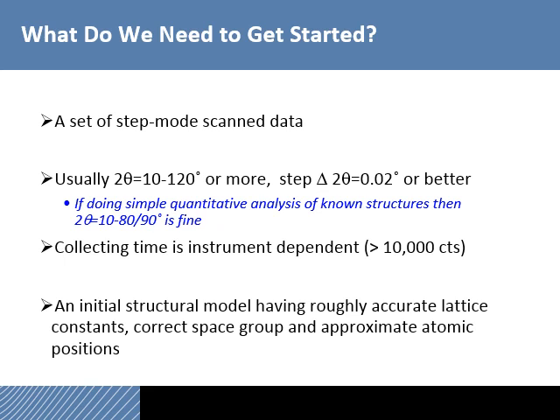And then you need some kind of an initial structural model having roughly accurate lattice constants, the correct space group, and approximate atomic positions to do the refinement. And then, of course, the idea behind the refinement is it will get you closer to your ultimate structural solution.